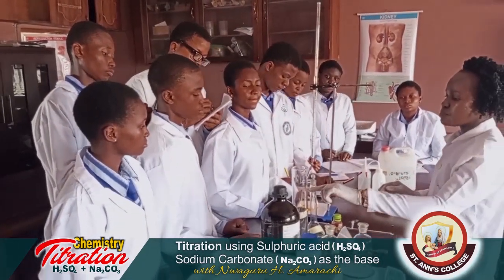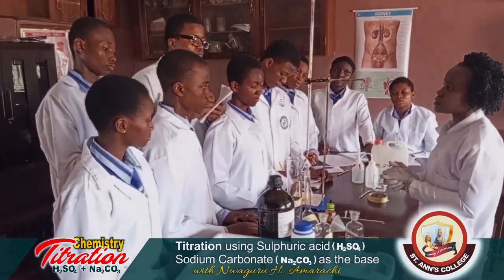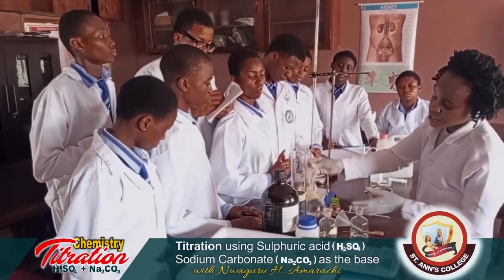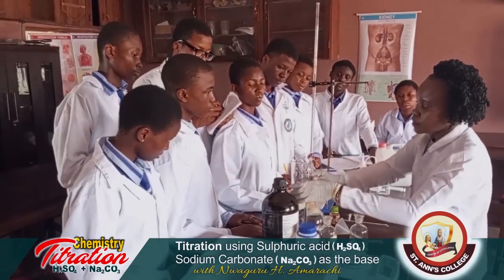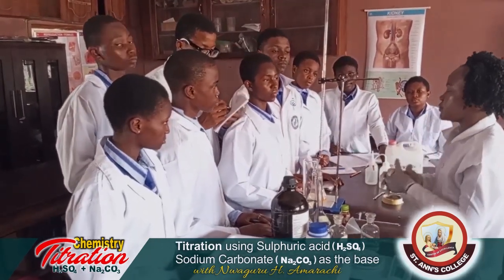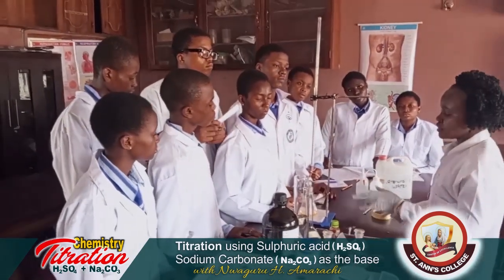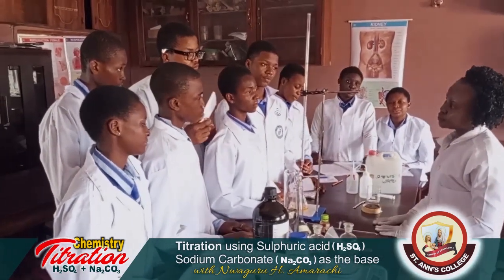That's the essence of this calibration, to tell you that they are of the same measurements. As you can see, it is written 500 ml, and this is also written 500 ml. So we diluted the acid in 500 ml, and we diluted the base in 500 ml.